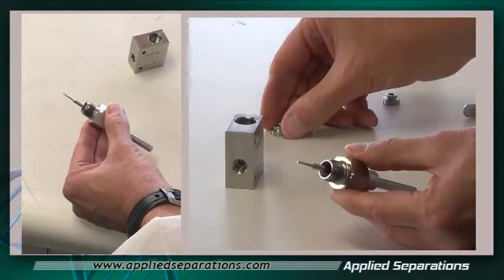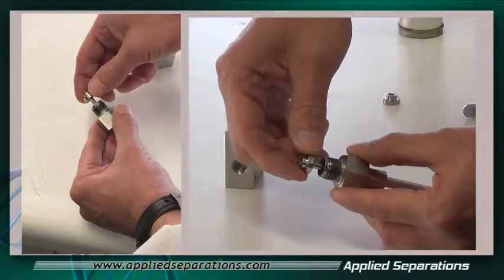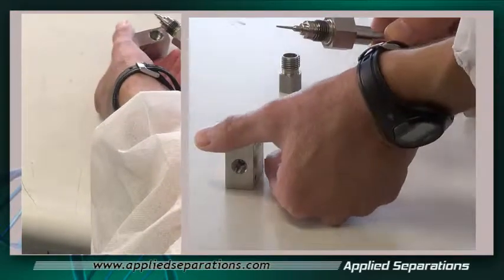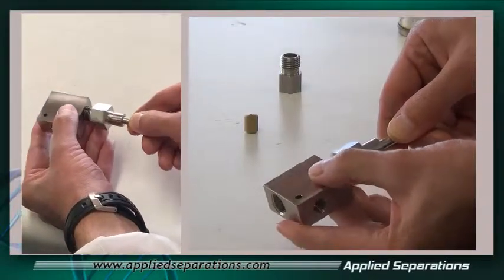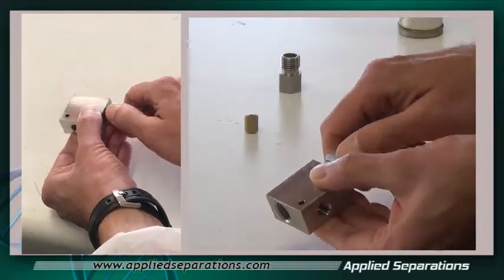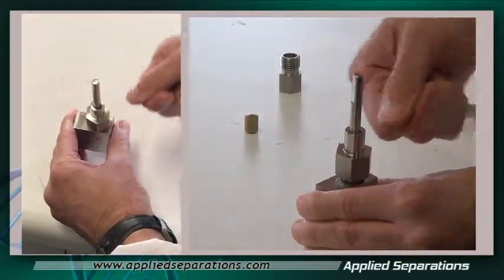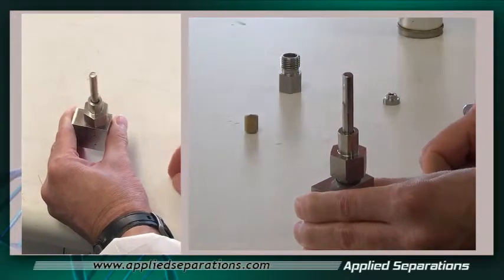Now take the large stainless steel washer and place it on there. Take the valve body and screw on the stem nut. You want to go finger tight and then use a wrench to tighten it just a little bit more. You don't want to go overly tight with that.